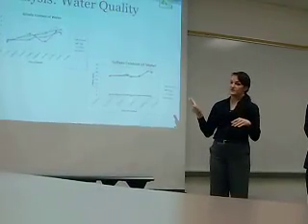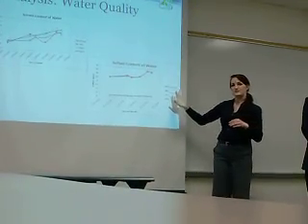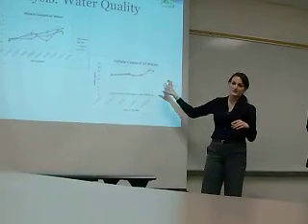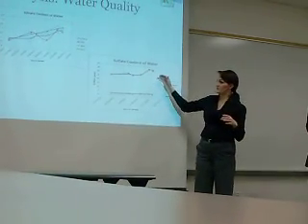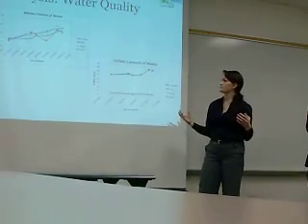And here we have the nitrate content and the sulfate content of the water. And one thing that's particularly interesting about the sulfate content is you can see that the reservoir samples are down here, whereas the brewery samples are all the way up here. And what this indicates is that during the water processing at the water handling facility in Crozet, they add sulfates to it for some kind of cleaning or for some kind of taste and quality improvement.